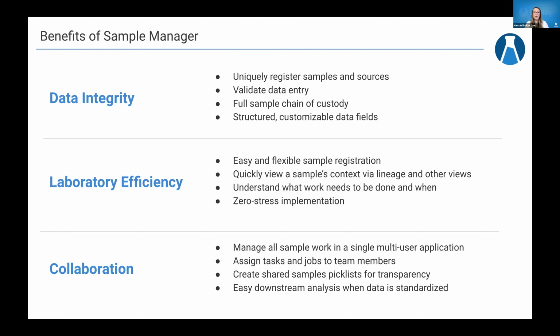Validating data entry as well. So this is very common in Sample Manager. You can create the field types that you want and ensure that when you say, please enter the draw date, you're getting a date and not anything else, as well as being able to validate ranges of values that are coming in, and imposing structure on text fields as well.